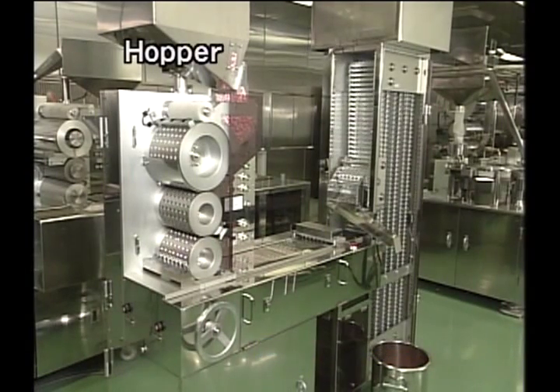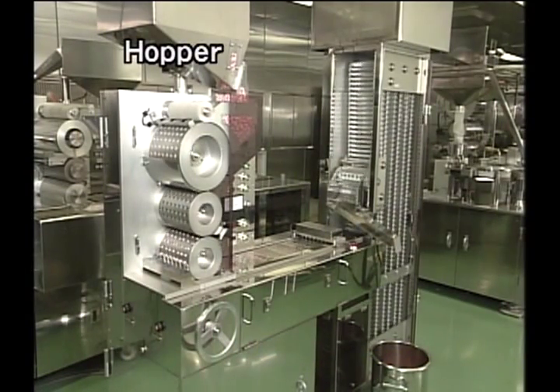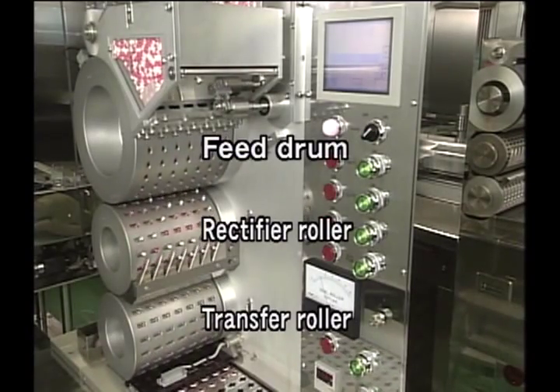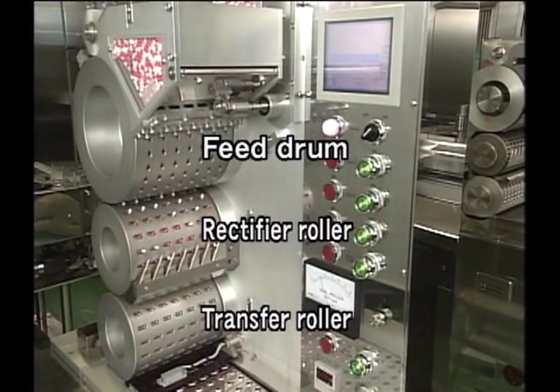At first the filled capsules are fed into the hopper. Then the caps and bodies that have a different orientation are rectified during the process of transport via the feed drum, the rectifier roller, and the transfer roller.